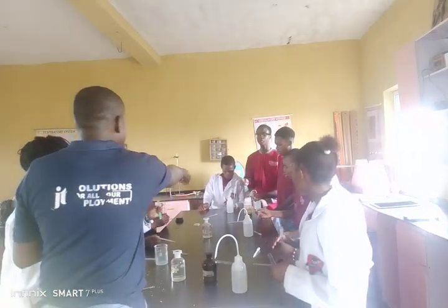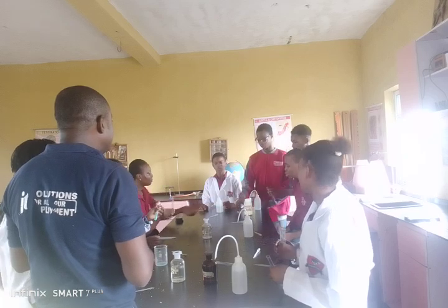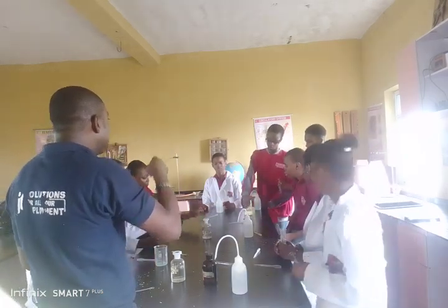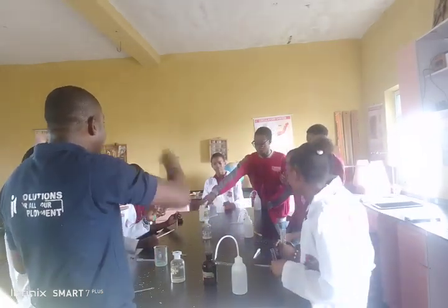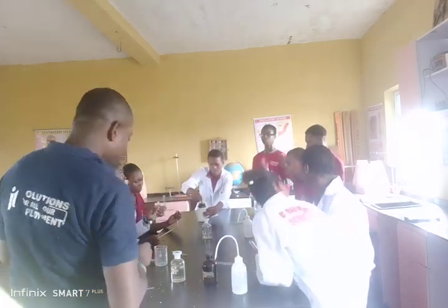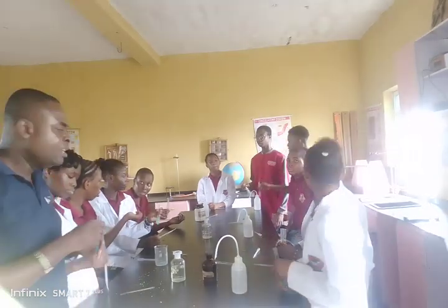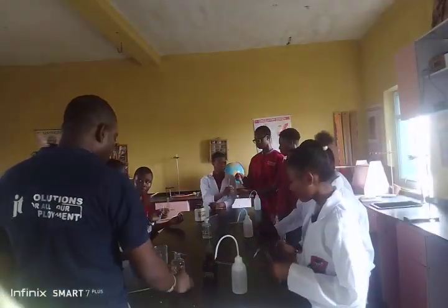So what we are trying to do here is convert this copper 2 chloride to silver chloride, which is a white precipitate and cannot dissolve. So what is the instruction here? It said to the second portion of solution C, let's go and add HNO3.